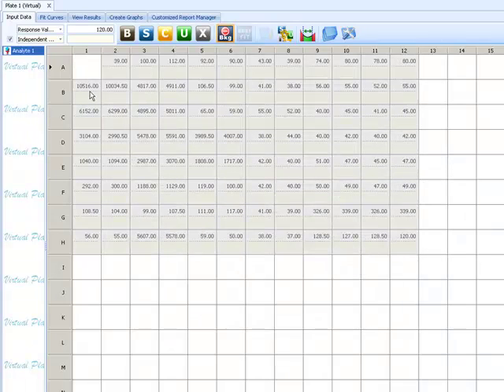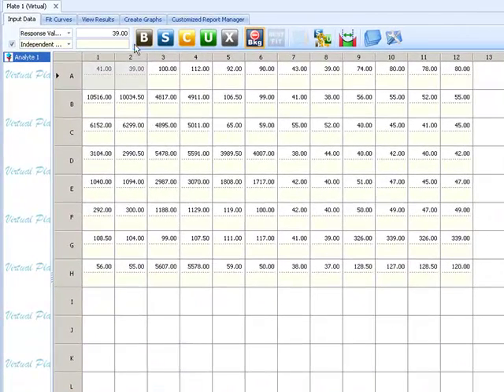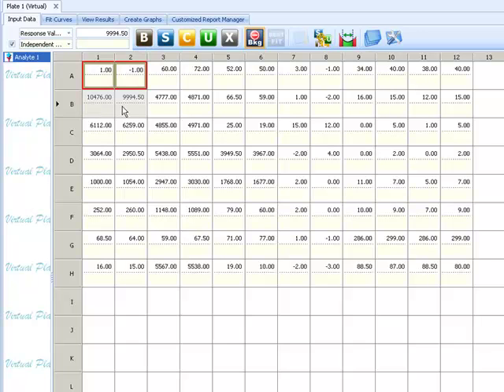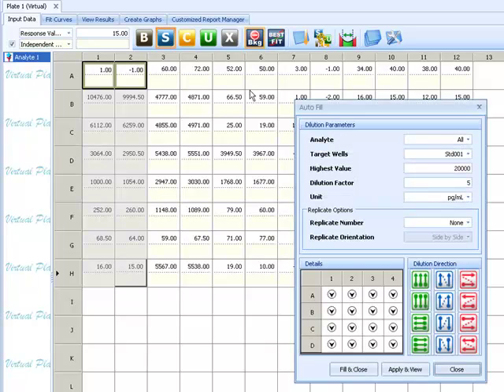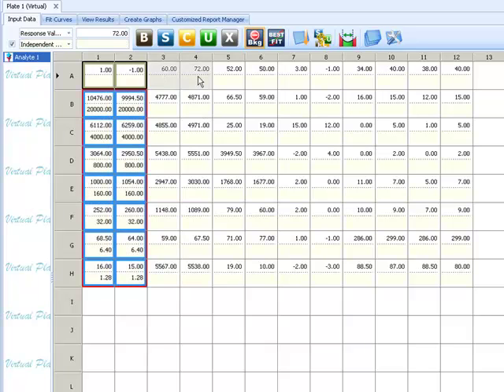Next, I will need to tell ReaderFit what my sample types are and how they are grouped. I will begin by indicating my background samples. Then I will mark my sample curves and input the independent values. This can be a set of samples for a standard curve or even a dose response curve. Lastly, I will mark my unknown samples which will be used to interpolate concentrations from the standard curve.